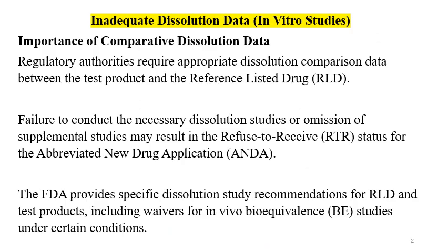So if we are typically talking regarding the ANDA, then if there is inadequate dissolution data or inadequate in vitro studies, then the US FDA can refuse to receive the ANDA. Also, many other authorities, after filing, ask for information and raise queries regarding dissolution.